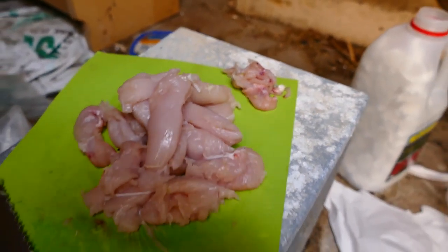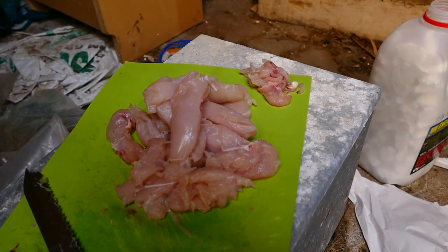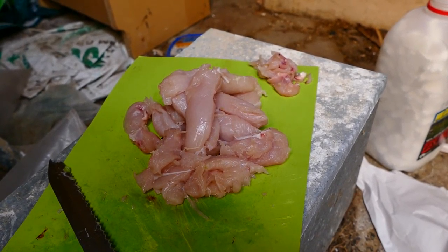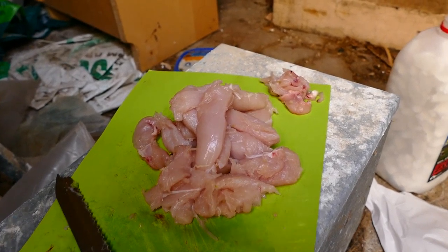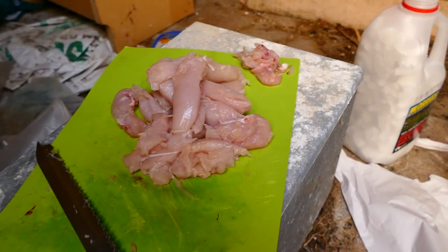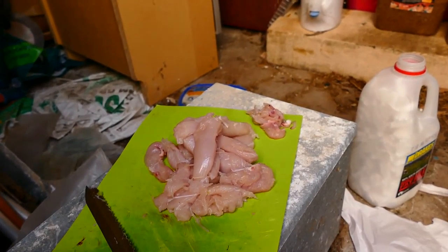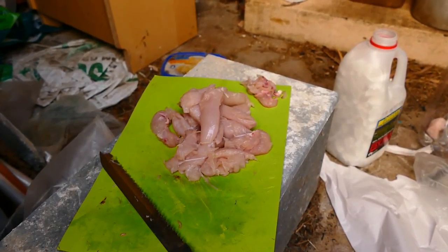There we go — we've got slug pieces. I'll use what I want to use and then freeze the rest. Maybe get something ready in the fridge — they'll only last a week or so. The other ones I'll freeze into nice units I can use for experiments, like two, three, or four experiments. Anyway, that's about it for this clip.